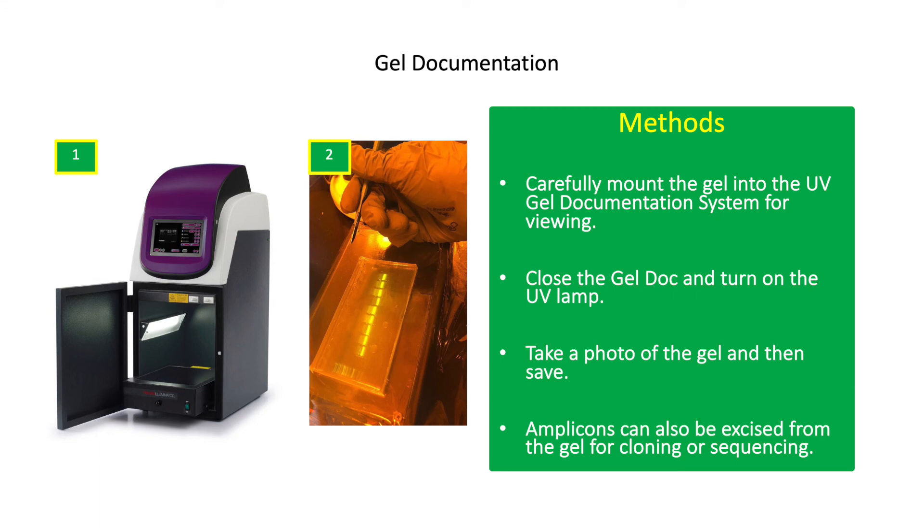Carefully mount the gel into the UV gel documentation system for viewing. Put a clear plastic wrap on the gel documentation system to prevent contamination with the ETBR stain. Close the gel dock and turn on the UV lamp. Take a photo of the gel image and save. Bands or amplicons can also be excised from the gel for purification. Purified amplicons can be cloned in plasmids for sequencing. Avoid long exposure of DNA samples to UV if samples are to be sequenced.